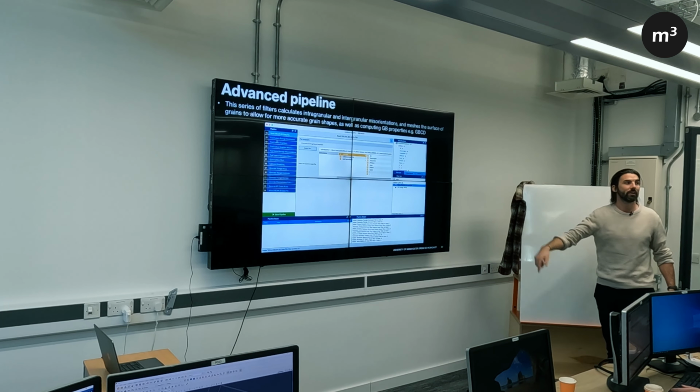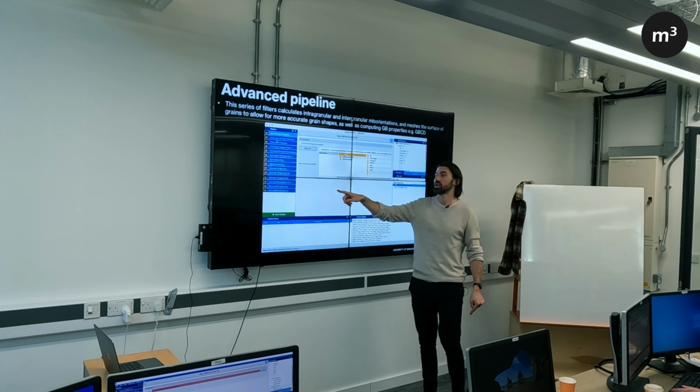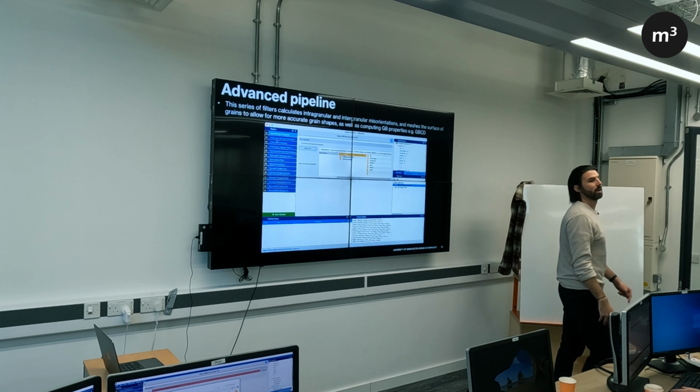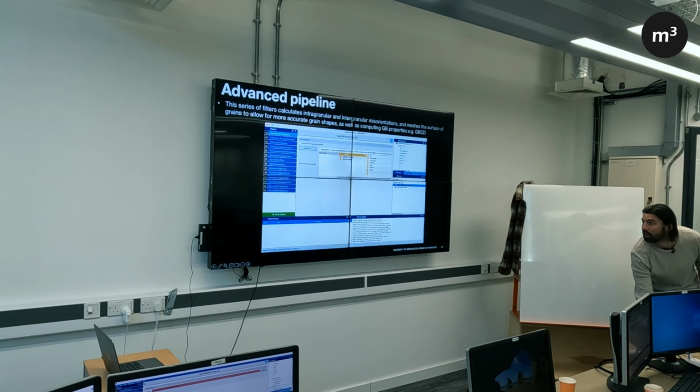And you can do that anytime you read it in, but be careful, because once you get rid of them and you do an action on it, and then you write this Dream 3D data file, they're gone then in that subsequent data file. So make sure you won't need them again in the future. So yeah, read Dream 3D data file, that reads it in.